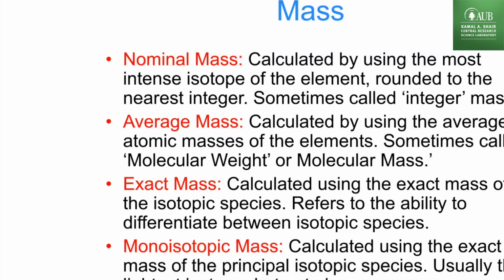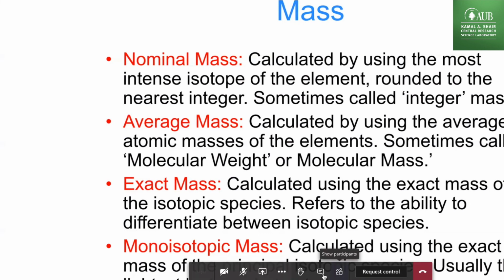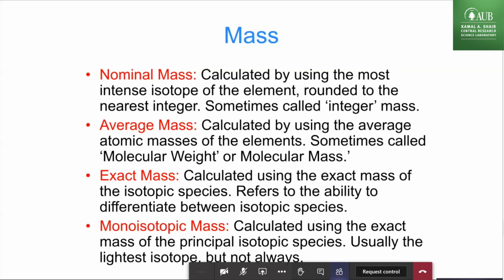No one? All right, so it usually says molecular weight, right? So be careful, especially if your compound has an isotope in it. If you buy a standard, usually the documentation and the package say the molecular weight. Can anybody guess the reason for that?